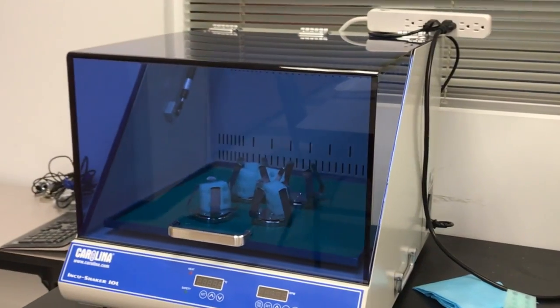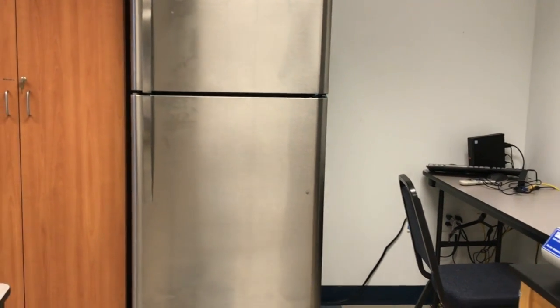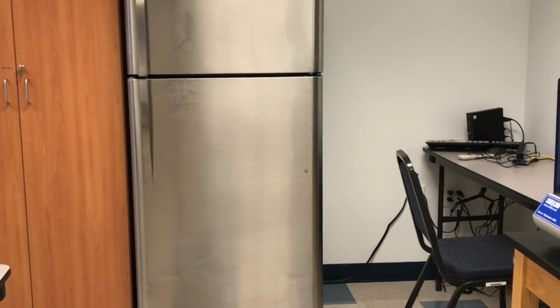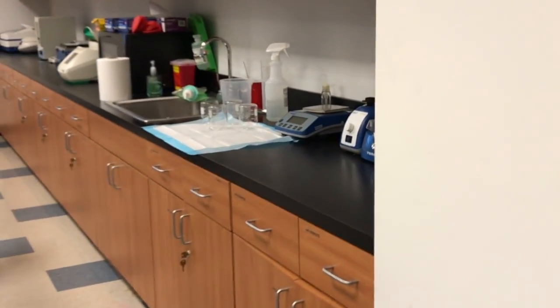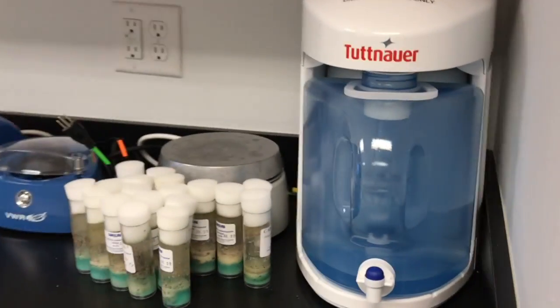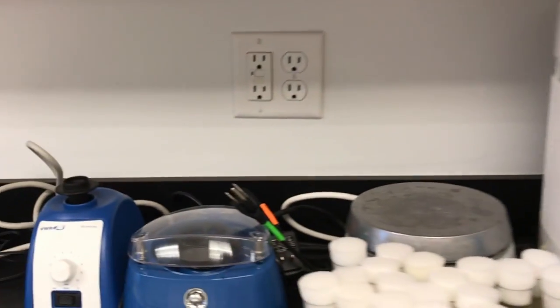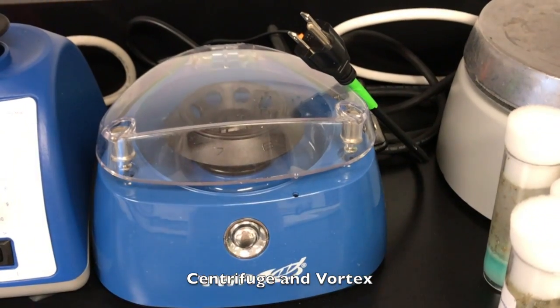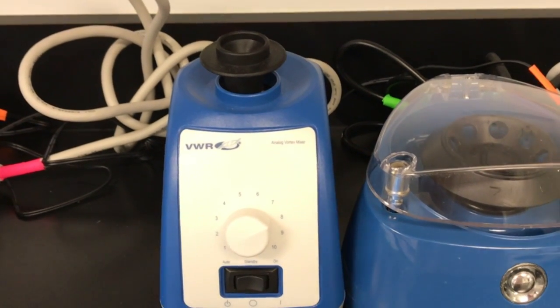Next to it there is a fridge — I guess you are familiar with that. A lot of samples in the biological lab need to be kept cool, and that's where we store all of those. If we move on, on this side at the back of the lab, we have a water purifier to make distilled water, and then here is a very small centrifuge where you can spin your samples.